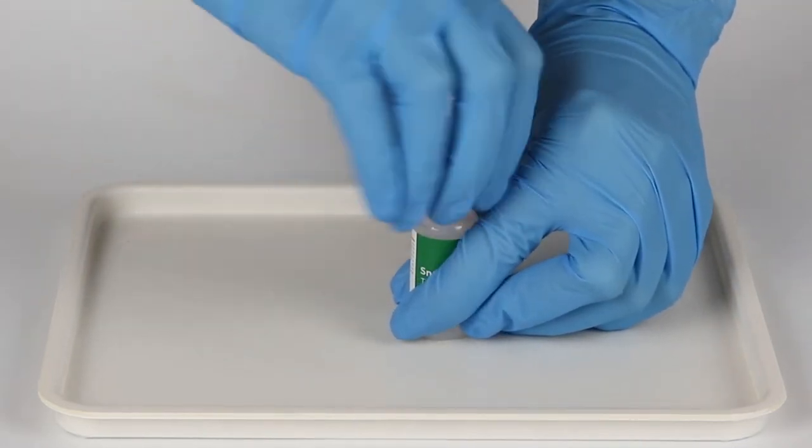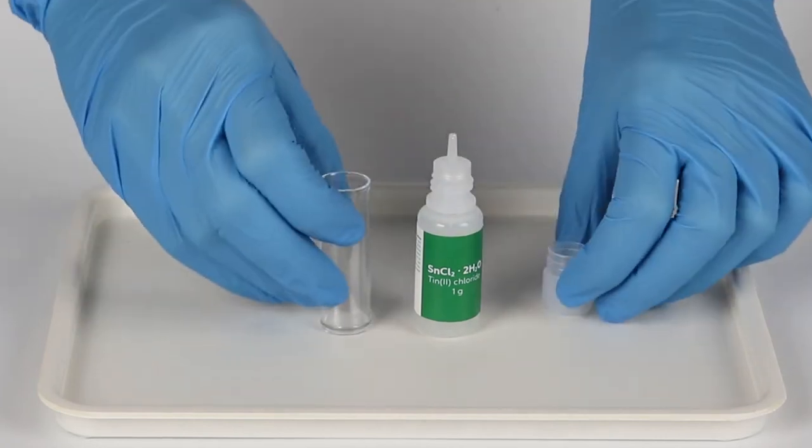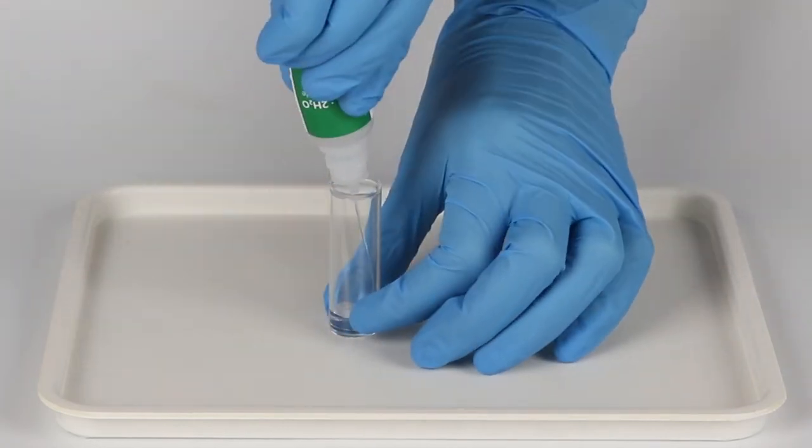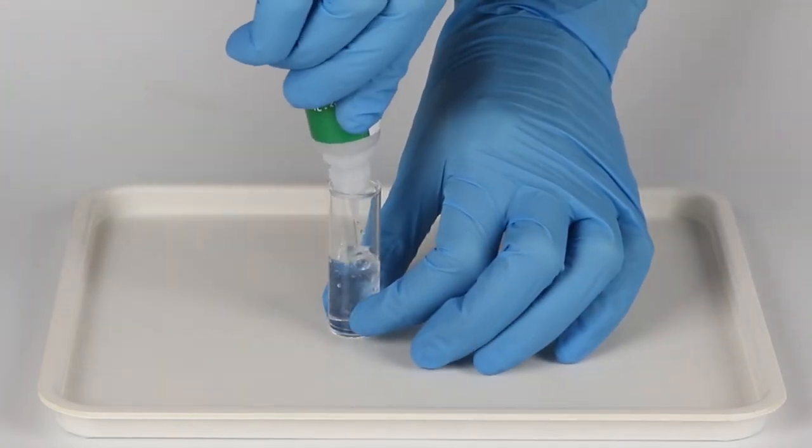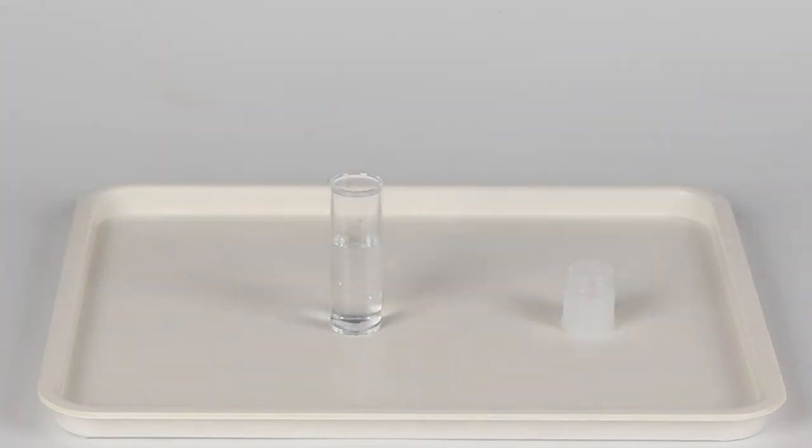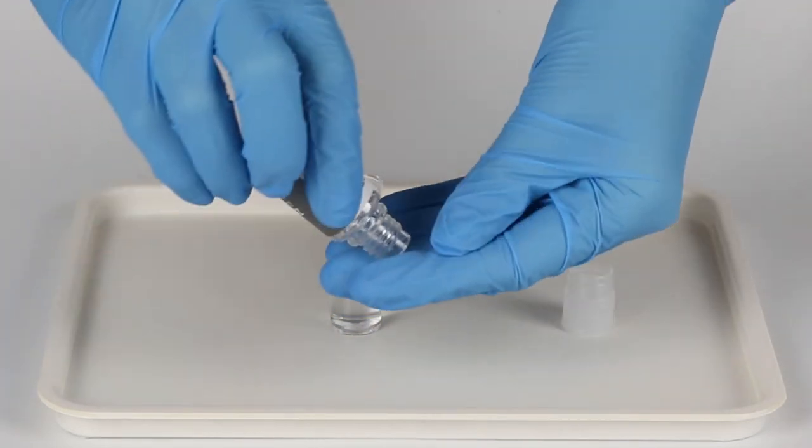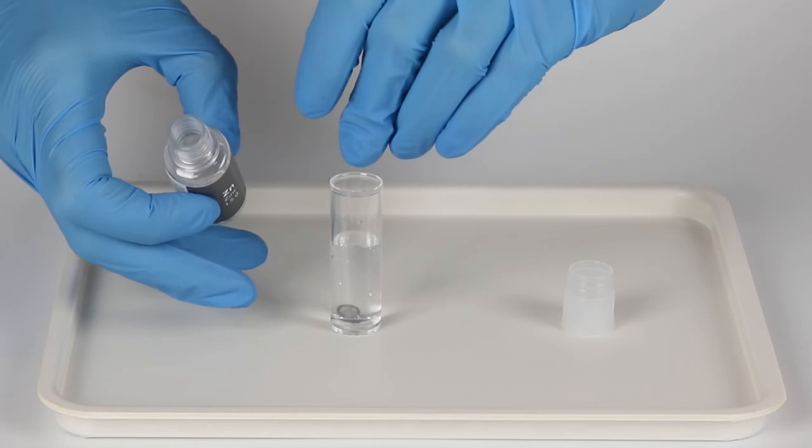Now open the bottle again and fill the vial approximately to its halfway point with the obtained solution. Take a zinc pellet and drop it into the vial. Seal the vial.